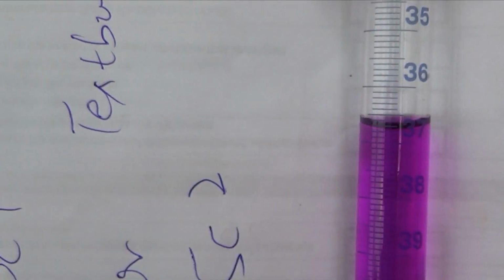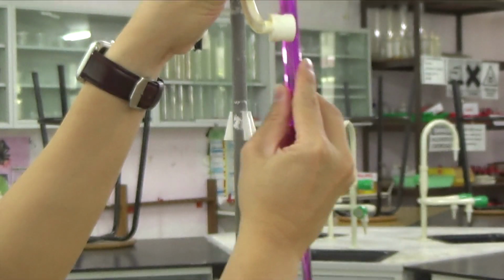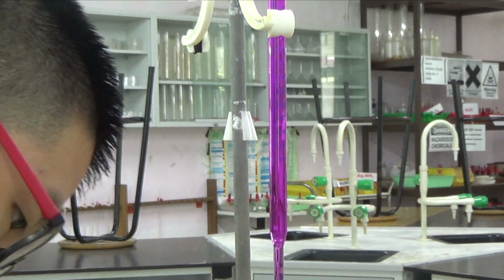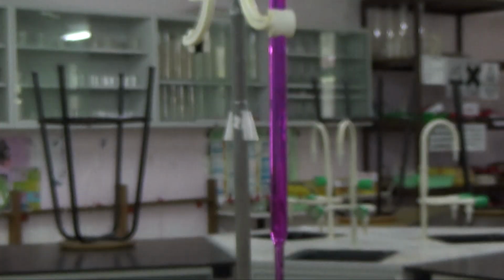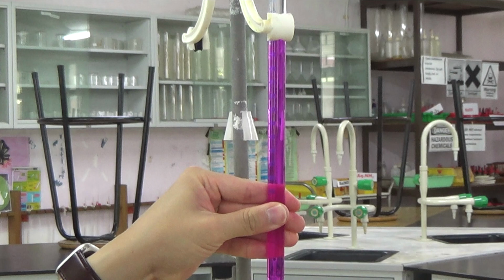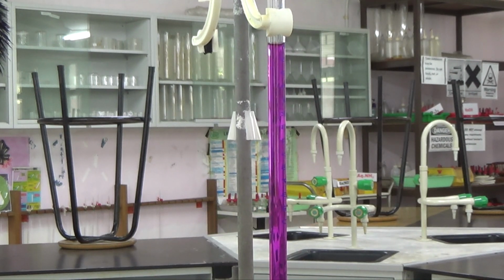I don't think that is eye level actually. So hopefully that is eye level now. So 36 and then 37 at the bottom. You read above the meniscus, so 36.5 cm3 there. So 36.5, and that should give me 21.5. 21.5 for my exact titre. What I'm going to do is I'm just going to add one extra drop and see what happens. So let's add one extra drop. 2 extra drops and see what happens.